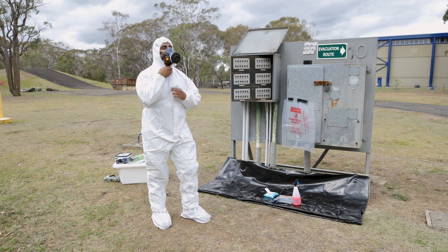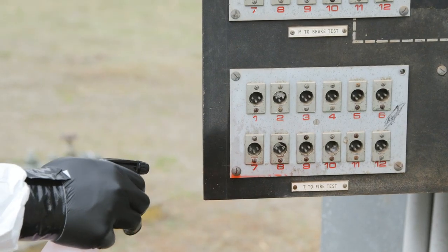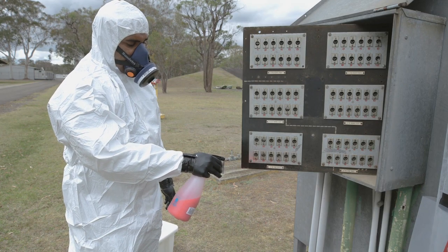Put on your PPE and RPE. Using your spray bottle, dampen the area you intend to sample. This helps to minimise the release of asbestos fibres and debris.